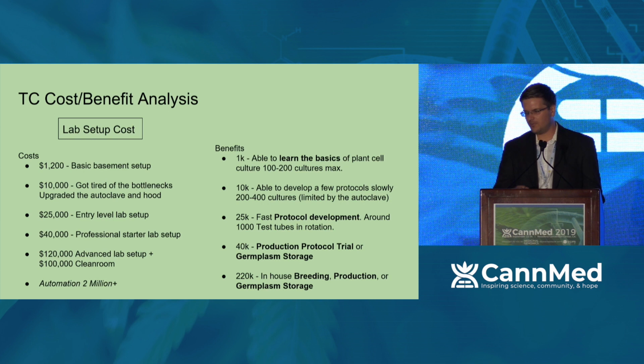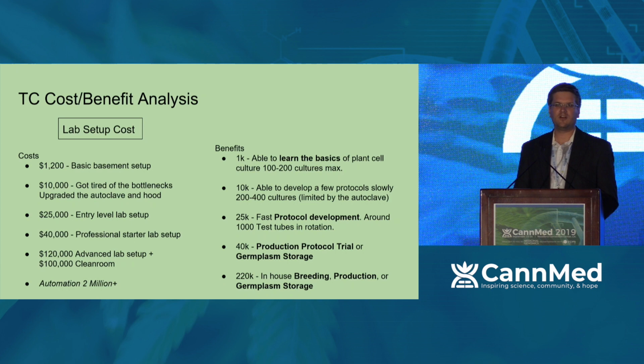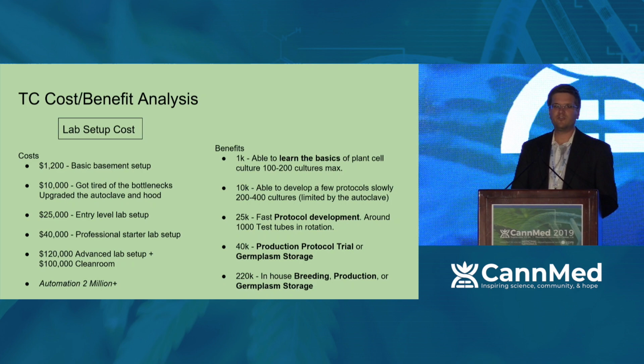So what I would recommend is to go with the essentially $35,000 to $40,000 lab if you really want to start and figure out what protocols you need to make or how to go about making them. You can always go a little bit cheaper if you need to, but that $40,000 range allows you to get a good hood and a good autoclave, and really put your plants through culture efficiently and successfully, while having the ability to trial some other medias and hormones just to make sure you're not shooting yourself in the foot. That being said, if you go with more expensive labs, you are still able to do in-house breeding techniques, and you're still able to do production and all that.